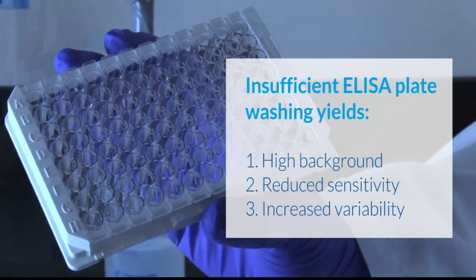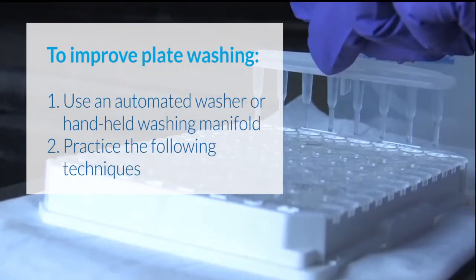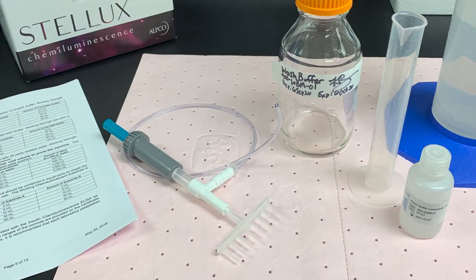A handheld pipetter should not be used to wash plates. Instead, it's recommended to use an automated plate washer set to 300 microliters per well or a handheld washing manifold. Prepare wash buffer as specified in your protocol.